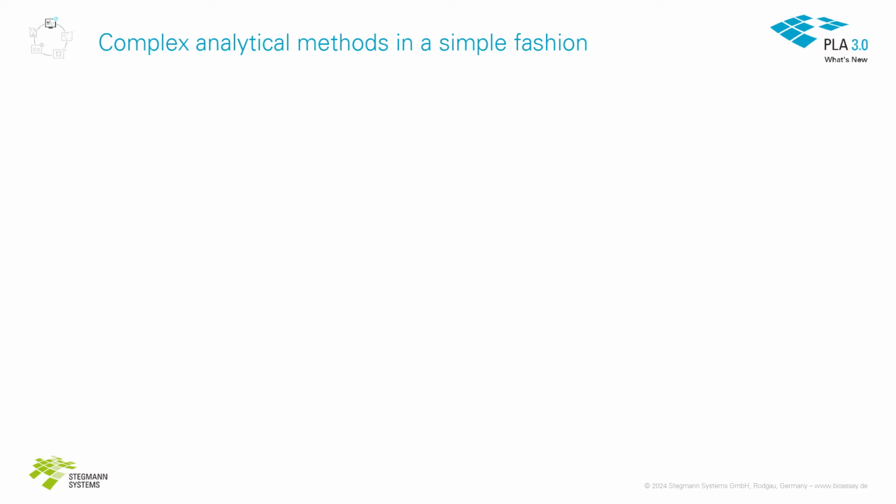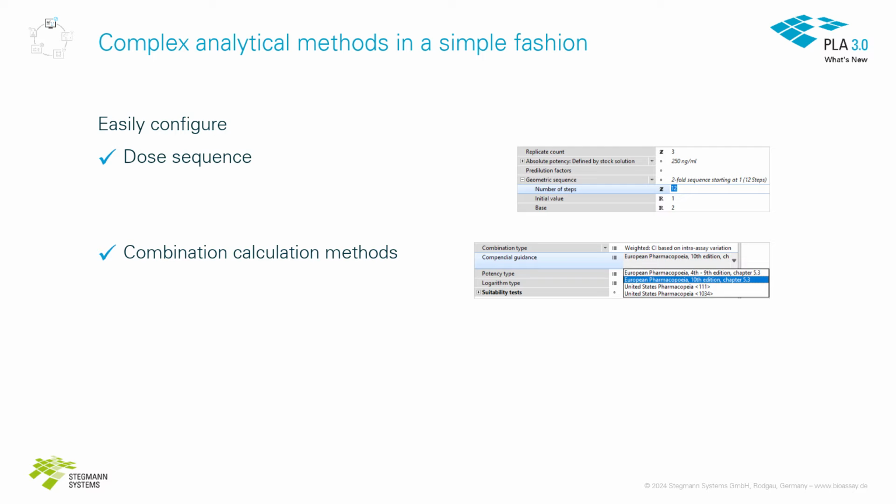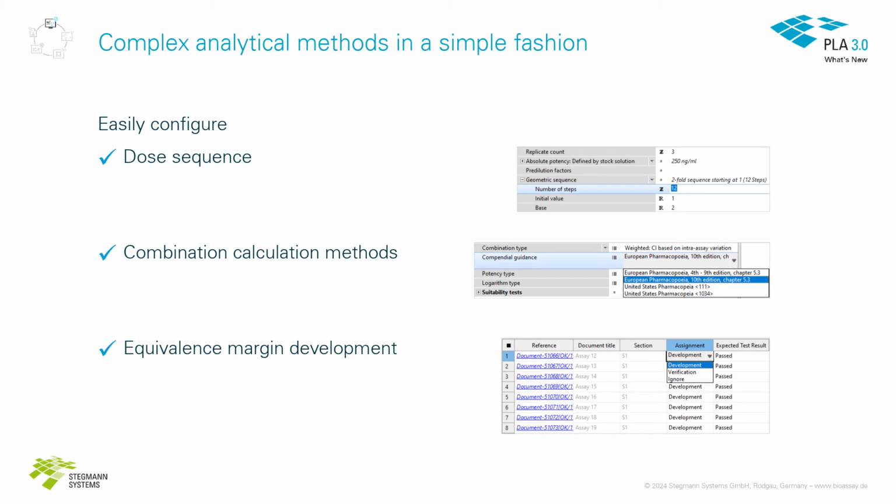The steps required to analyze an assay may become very complex. Use our newest version to make the configuration of dose sequences, combination calculation methods, or the development of equivalence margins feasible in a few minutes. Some areas even provide additional functions, such as using dilution factors to describe the dose sequence.